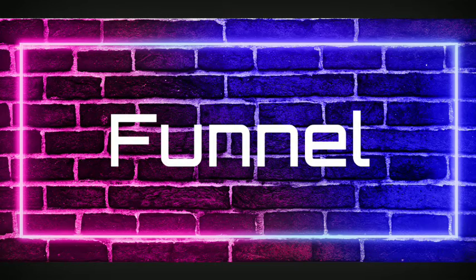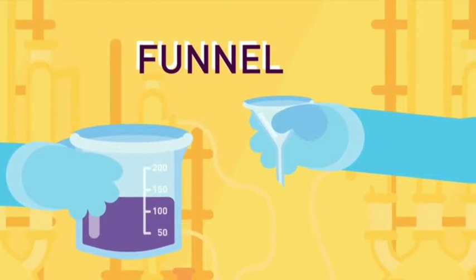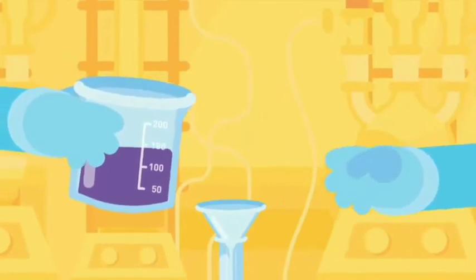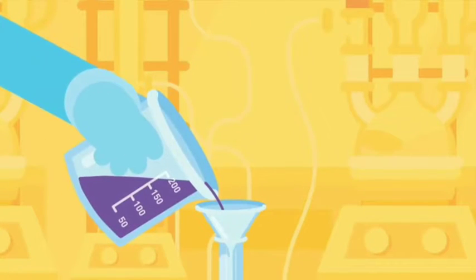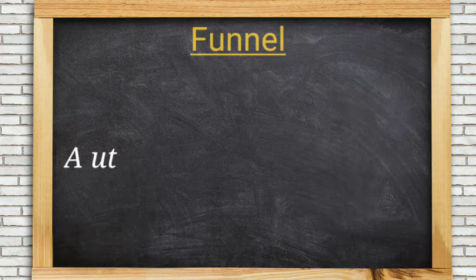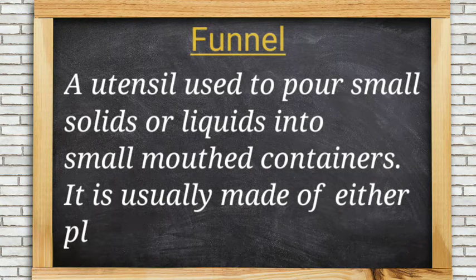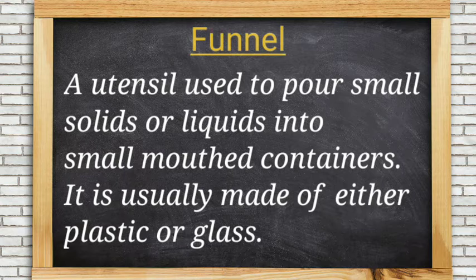Funnel. It is used to transfer liquids or fine-grained materials into containers with small openings. Also used for filtration. A utensil used to pour small solids or liquids into small-mouthed containers. It is usually made of either plastic or glass.